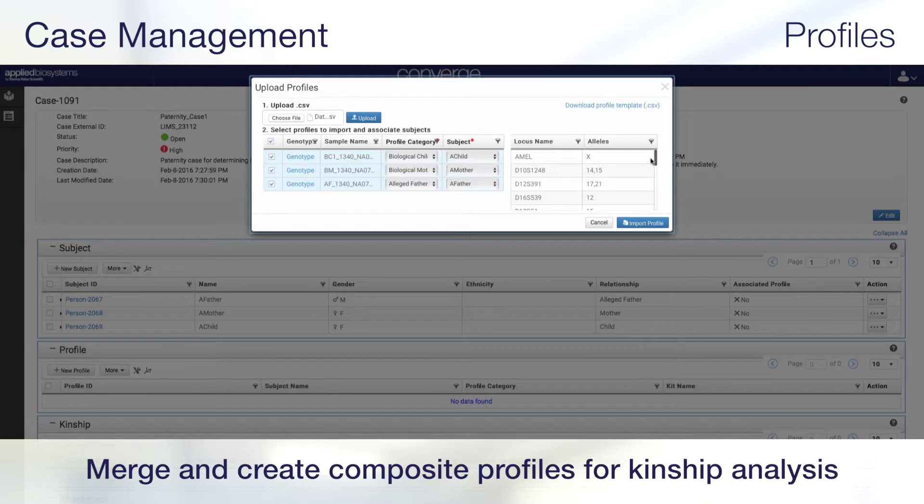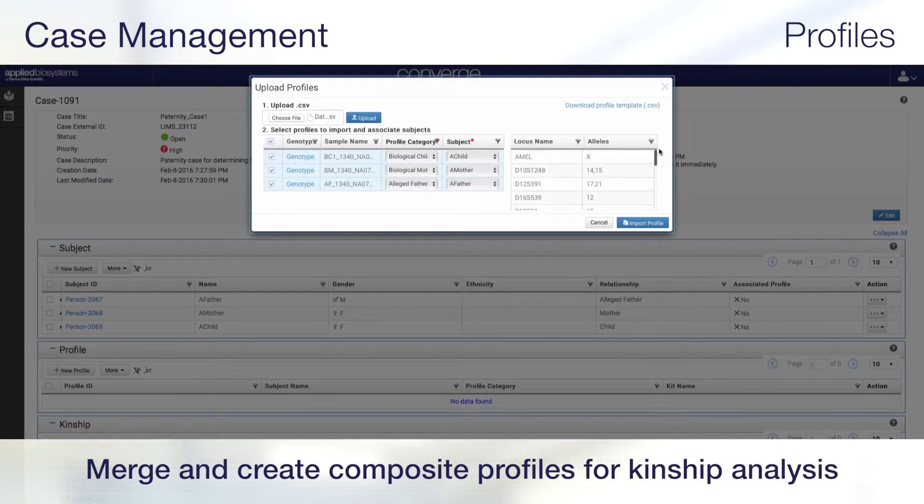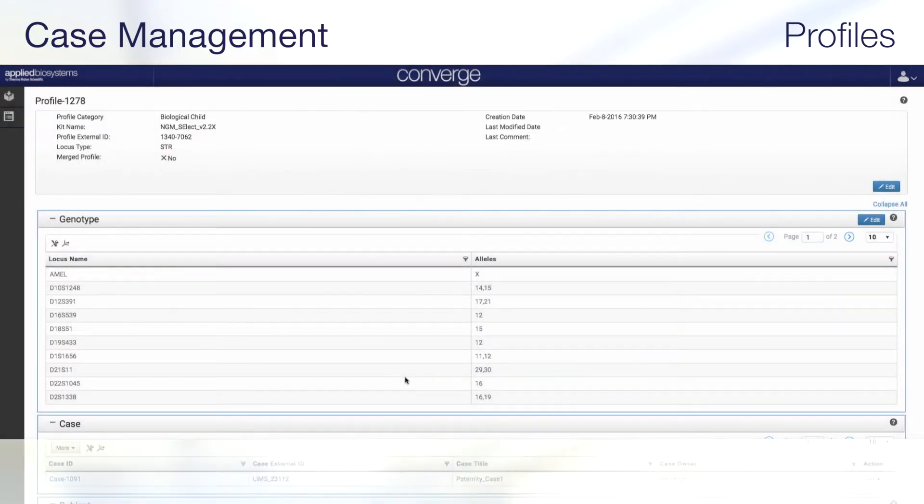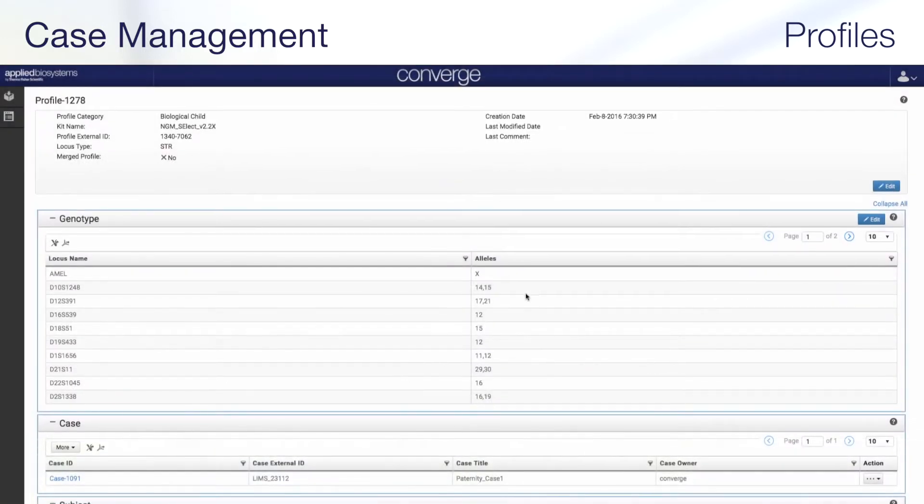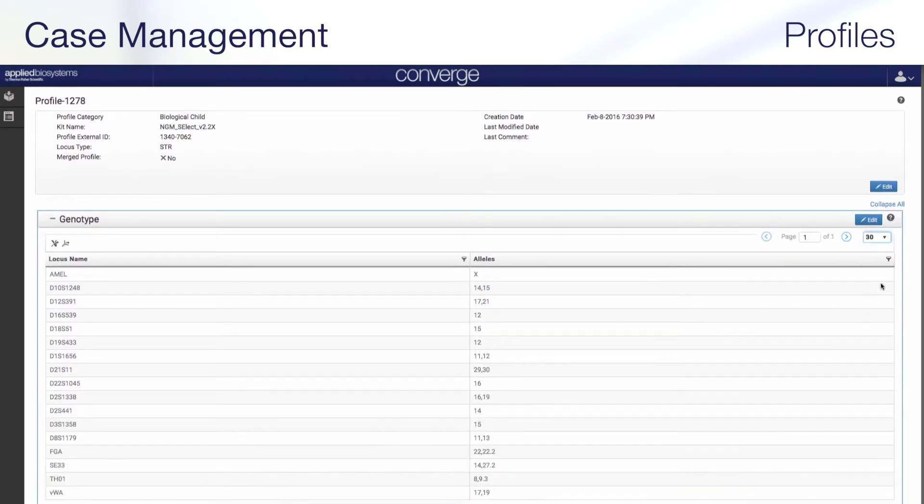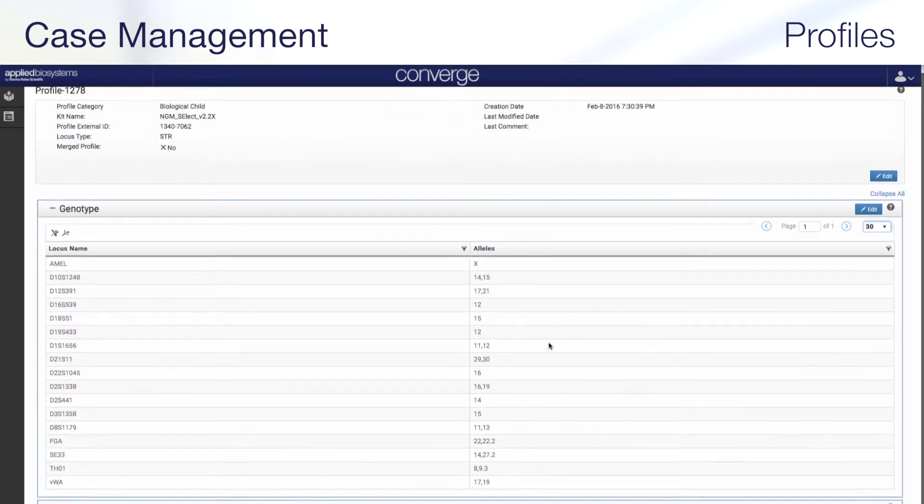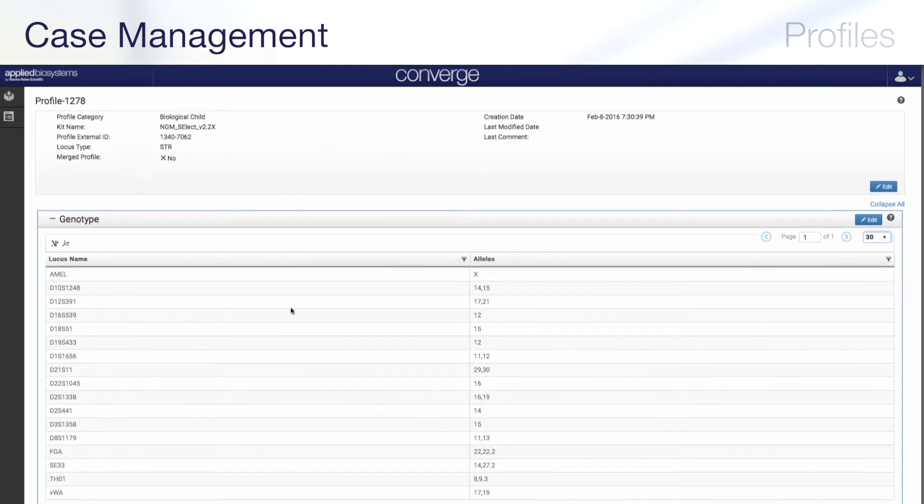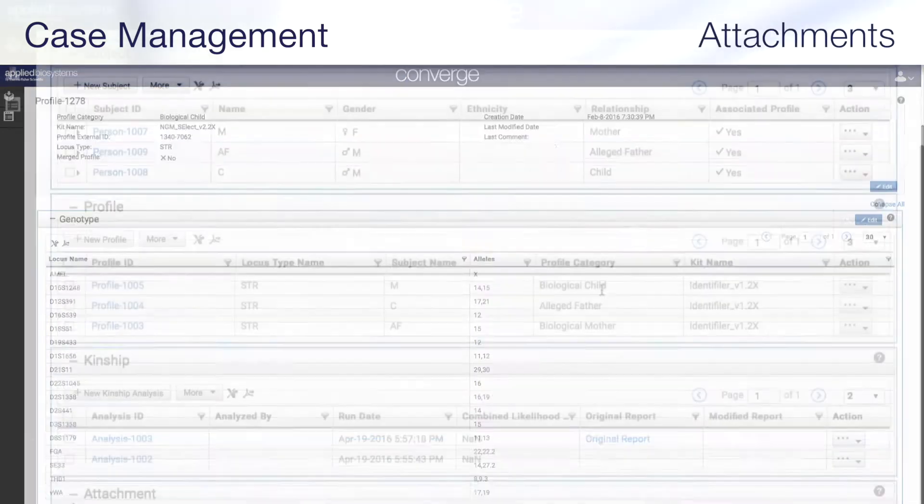Converge software also offers the ability to merge profiles and create a composite profile. The DNA profile, along with its metadata, including the kit used to generate the data, is preserved and can be reviewed in the profile page.